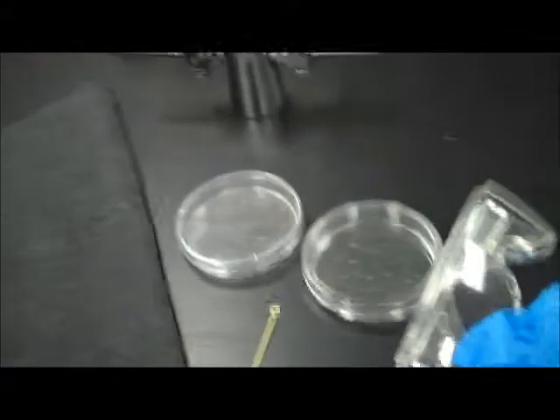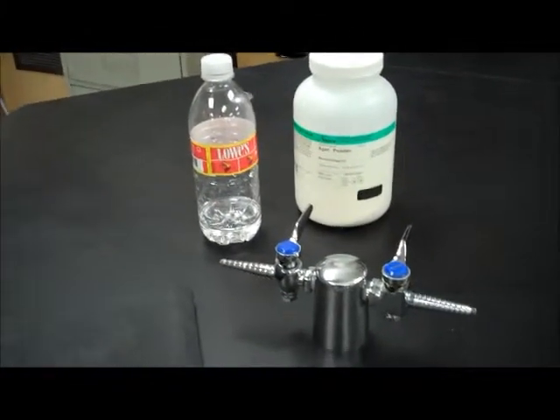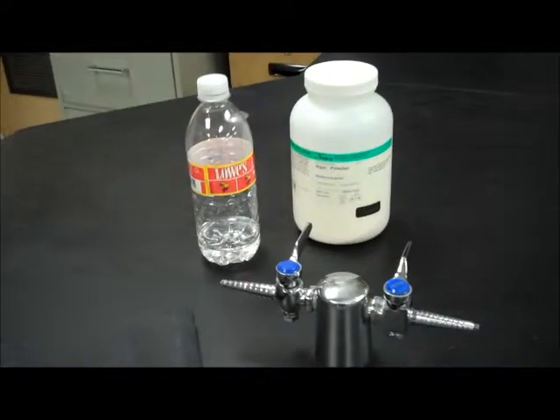So if you bring food or drink, it's very easy for it to be infected by the bacteria, and that'll make you very sick. So it's important not to bring food or drink into a lab.